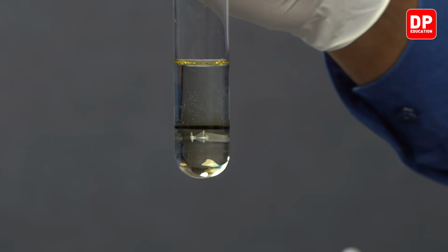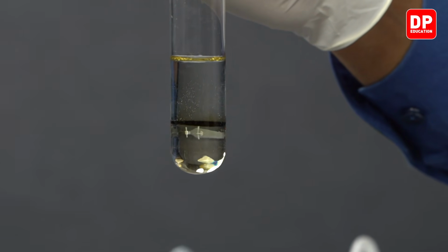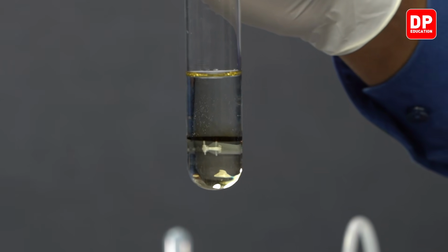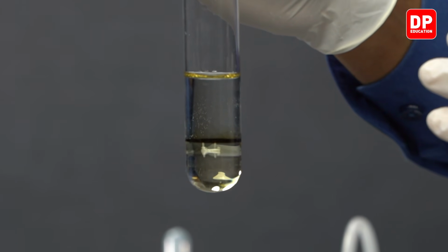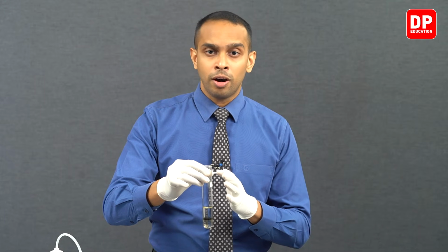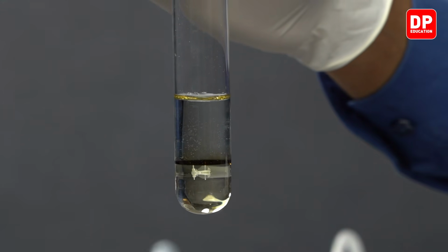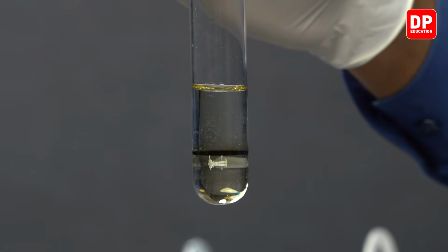Now students, what we did in this experiment was making a reaction mixture where Fe2+ ion solution was added with nitrate ion solution, and we cooled it down, and afterwards we poured concentrated sulfuric acid along the wall of the boiling tube, and without disturbing the top layer, sulfuric acid dropped to the bottom of the boiling tube, as concentrated sulfuric acid was denser.